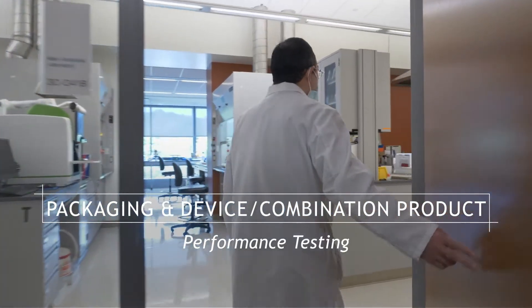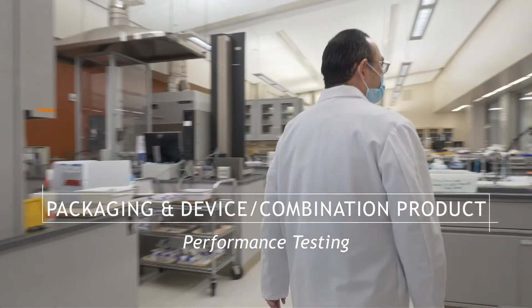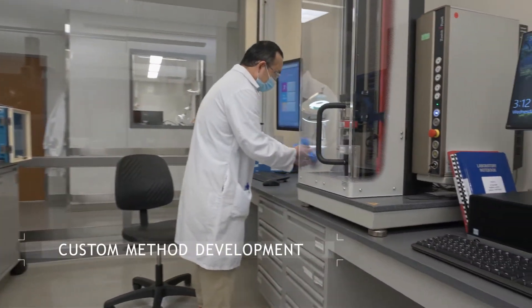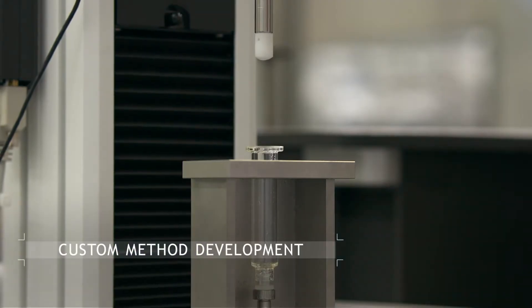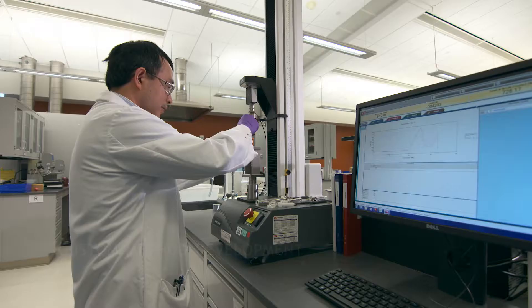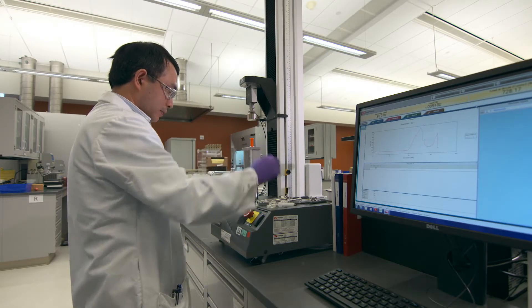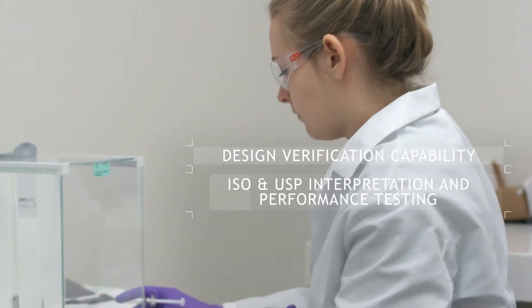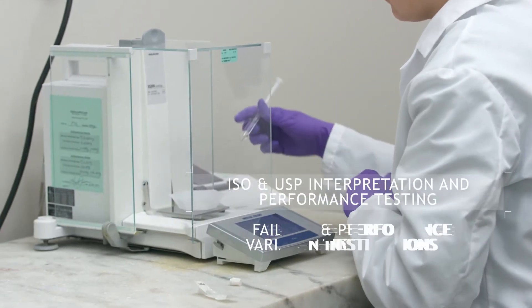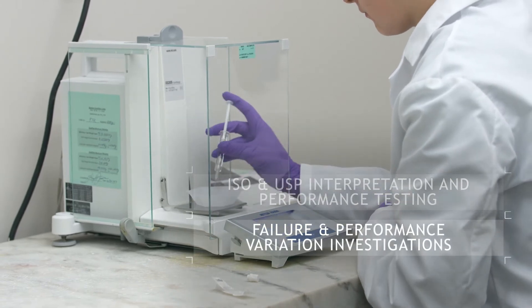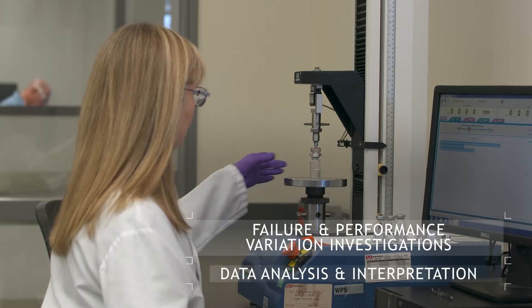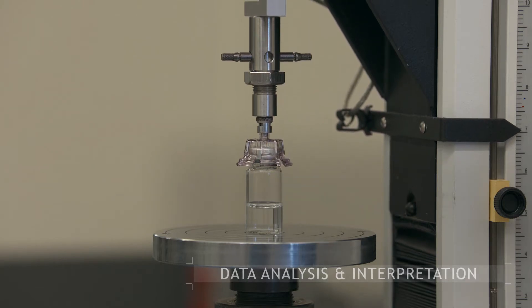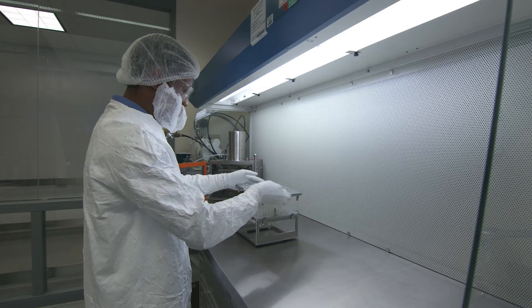WEST's dedicated packaging and device combination product performance testing group works with customers to develop custom protocols specific to their needs and the needs of the combination drug product. Studies cover a variety of administration and delivery systems and all related components and devices. With expert knowledge of the market, industry standards, and customization of testing designed with regulatory need in mind, our experts can help reduce both launch schedule risk and risk to the patient.